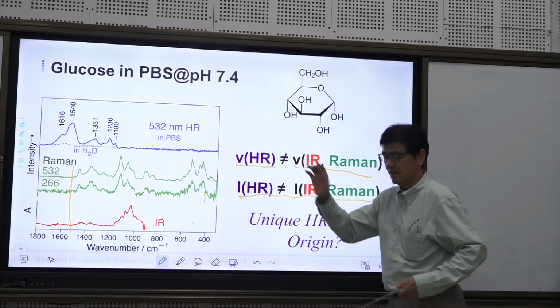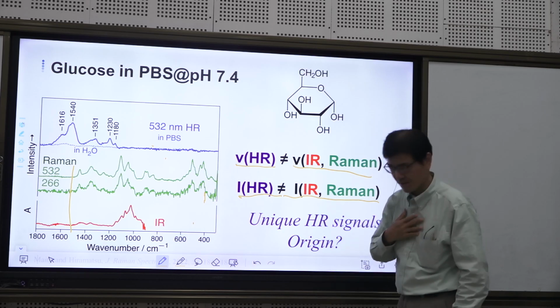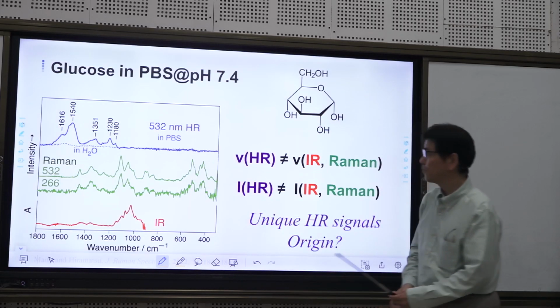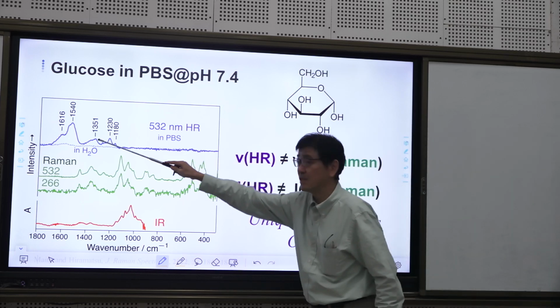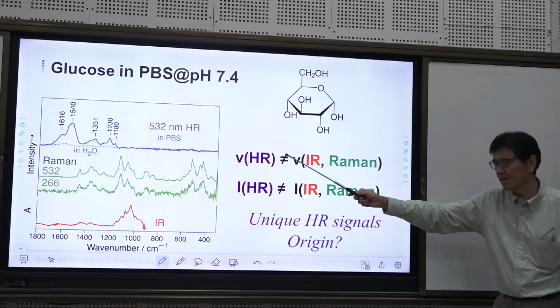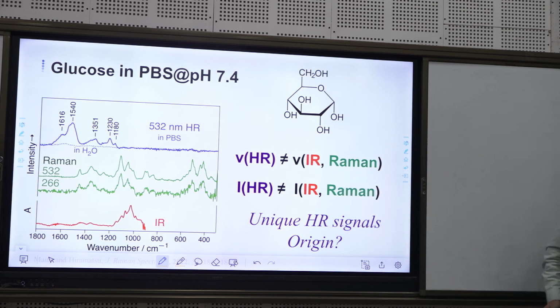Then finally, I was glad. I can say hyper-Raman spectroscopy gives unique information. But we don't know what is the origin of this peak. So we started to study the origin of this hyper-Raman signal.